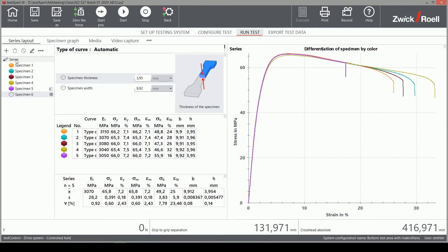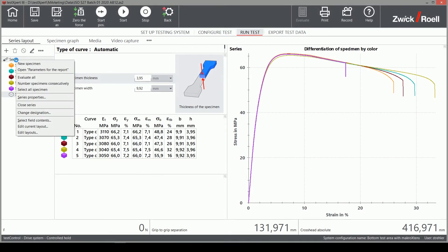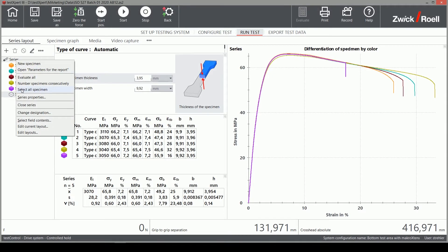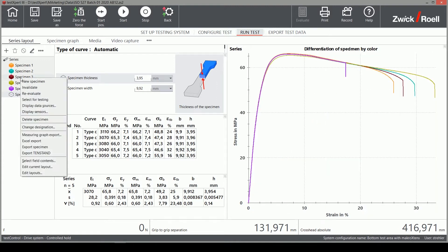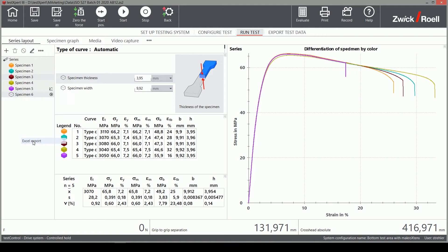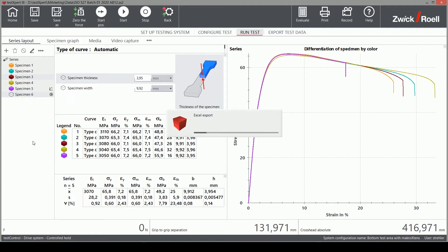First, I prepare the Excel file with all the data our lab manager needs. I select all samples from this series and I just press the right mouse button and select Excel export. With just one click, the export is complete.